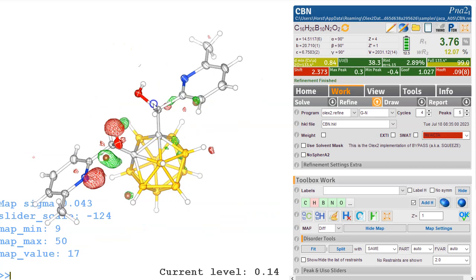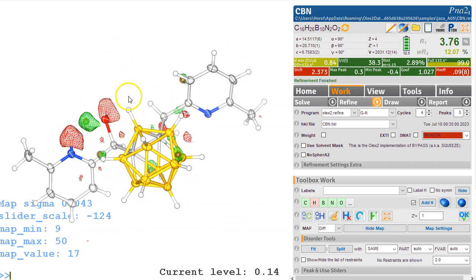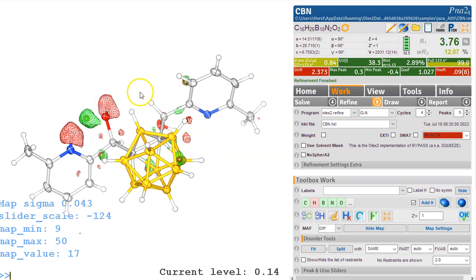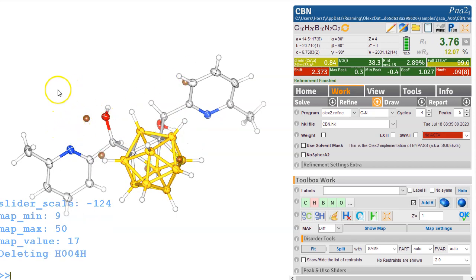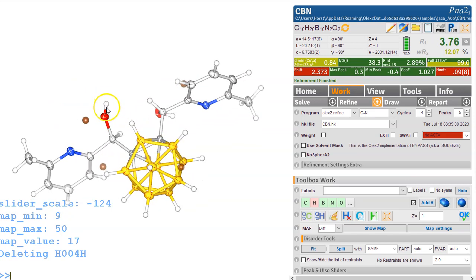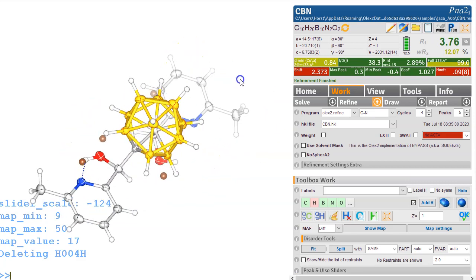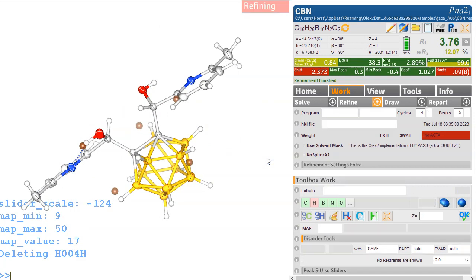So Ctrl M shows us a couple of things. Firstly, it added a hydrogen here where there isn't one. And I suspect it added that first and then added this one in the wrong place because it looks at hydrogen bonding potentials. So first of all, let's delete this. And there's a number of ways. The easiest of course is to delete this hydrogen atom and then H add again, it will put it in the right place. But I'll just show you another way. You could actually select this grouping, this oxygen and the hydrogen, and then use the fit. And you can right click on a bond like this, and then you can move it over. So it's like a rotor, it's moving it around that bond. So again, deleting it and then fitting it again is by far the easiest way of doing it.